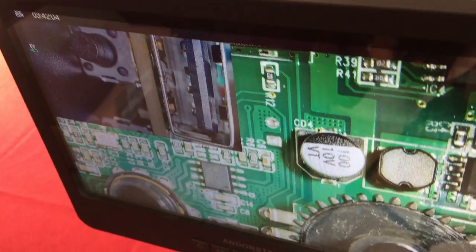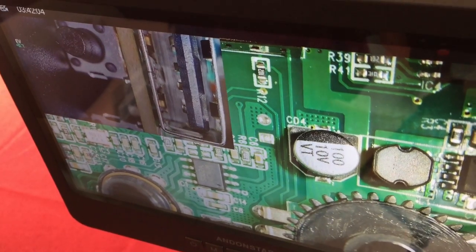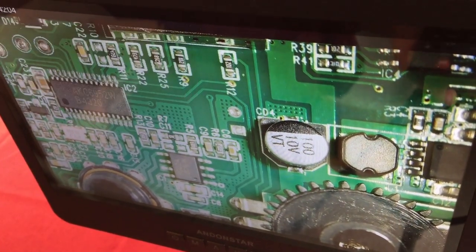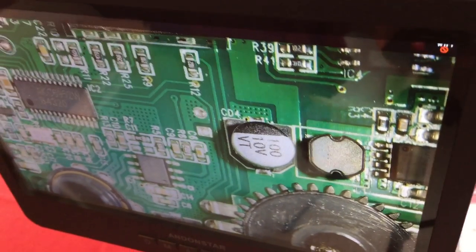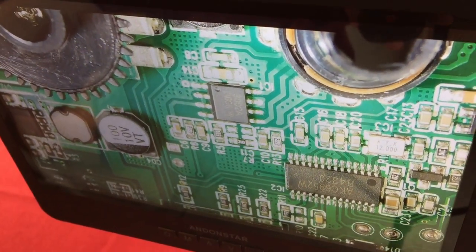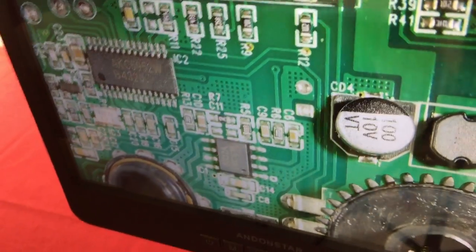Switching back to picture-in-picture by hitting the same button on the remote, aiming it at the monitor. Then there's a button that lets you flip the image upside down if you need to do that. Very cool and enjoyable.